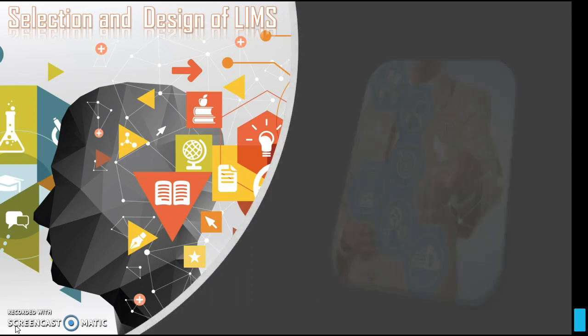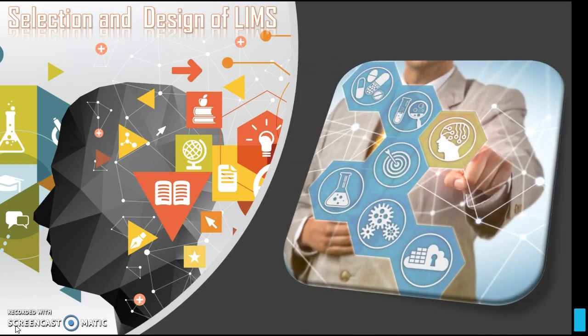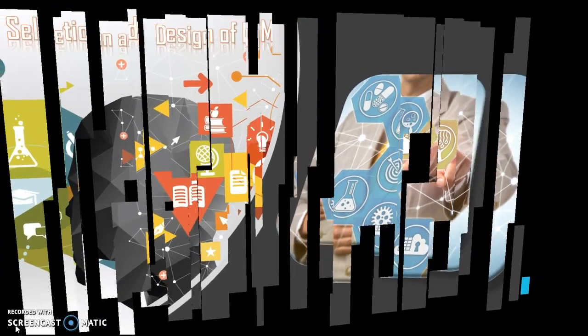It is essential that the system supports the laboratory in establishing, maintaining, and applying quality procedures, thereby enabling the laboratory to achieve its quality goals. As a tool, LIMS permits the laboratory to input and use its own know-how and expertise to optimize the total organization and workflow of generated information.